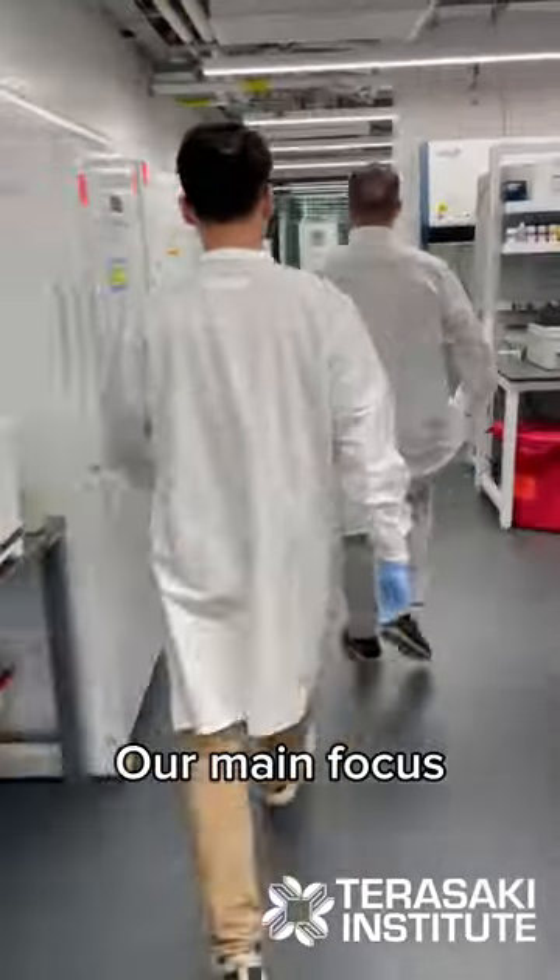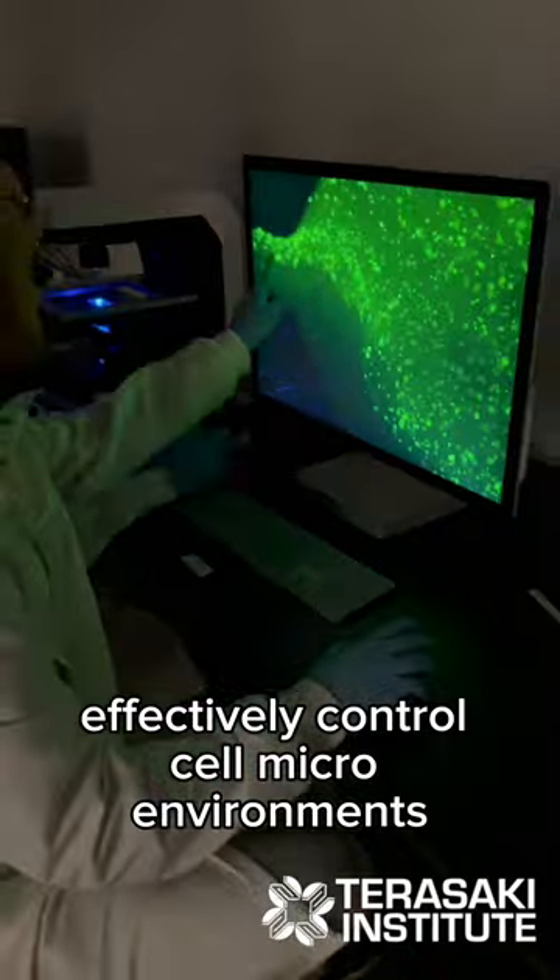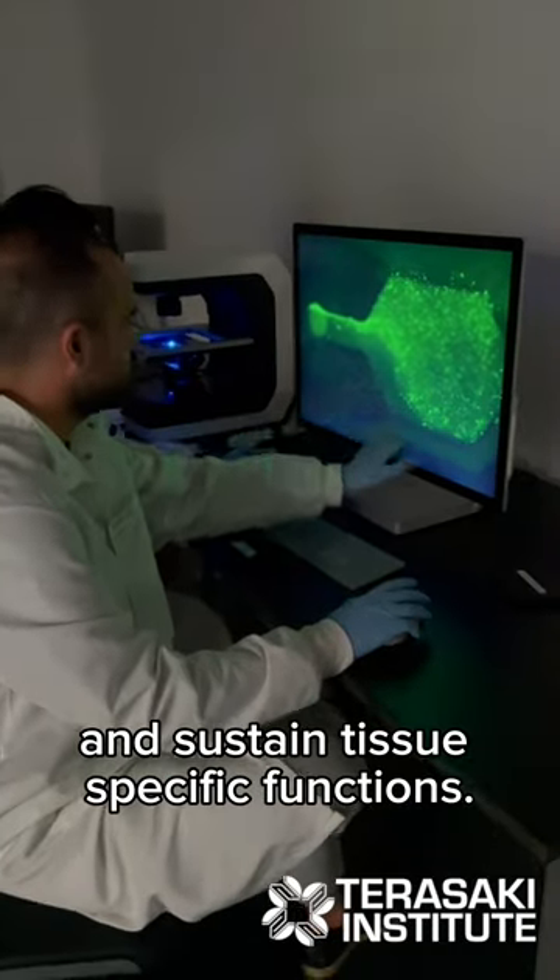Our main focus is to design these chips in such a way that they can effectively control cell microenvironments and sustain tissue-specific functions.